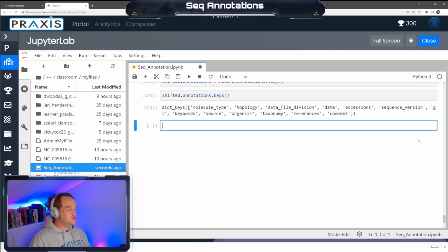So you should probably change the record identifiers, since NCBI references refer to the original unmodified sequences, as that's why it's cautious. So you probably shouldn't be doing this a bunch unless it's just for your annotations.